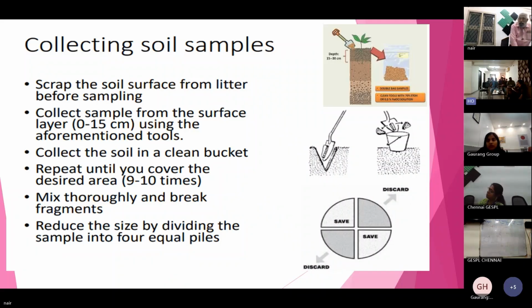Sir, is there any chance of getting PM 2.5 more than PM 10? Getting PM 2.5 more than PM 10, no chance. If it is so, then something is wrong in the gravimetric analysis, because once the filter paper comes from the field, it may have some moisture content.